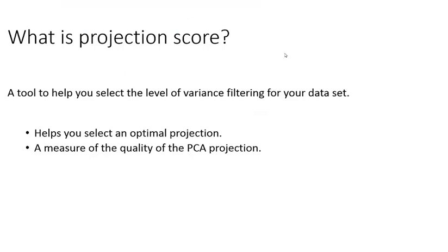A peculiar feature of many high-dimensional data sets is that they're often collected with an exploratory aim, without a specific hypothesis in mind. This means, among other things, that a data set may contain many variables that are not really informative, and the informative structure is hidden in the vast amount of data you have gathered.